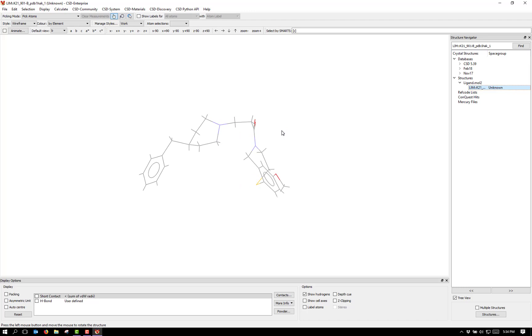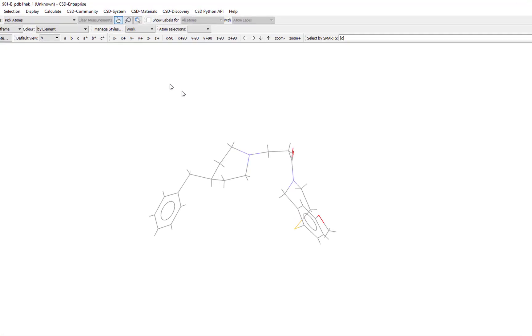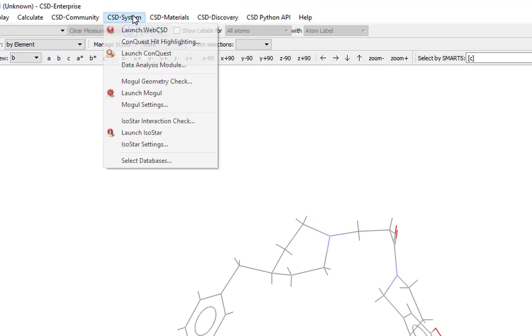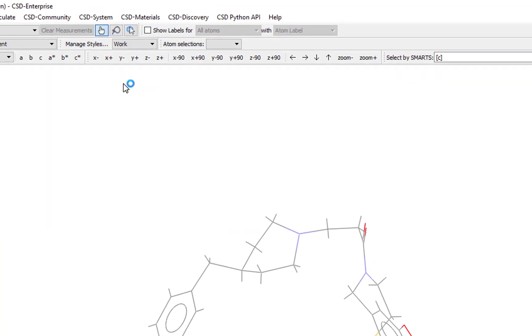To run the Mogul geometry analysis, choose CSD system from the top level menu and then select Mogul geometry check.